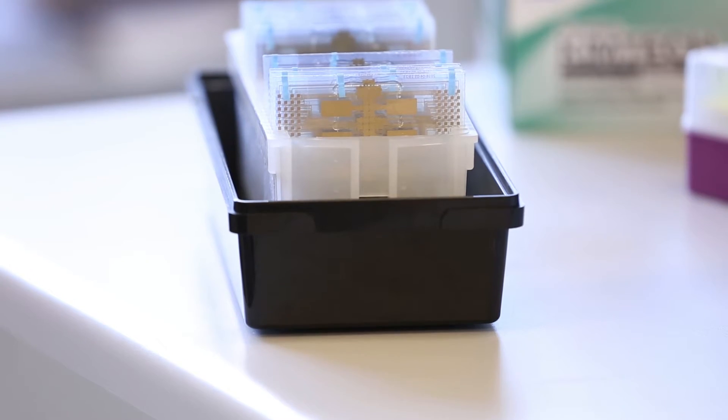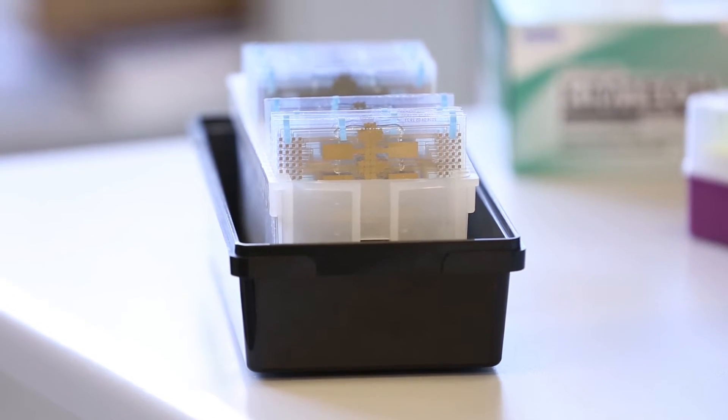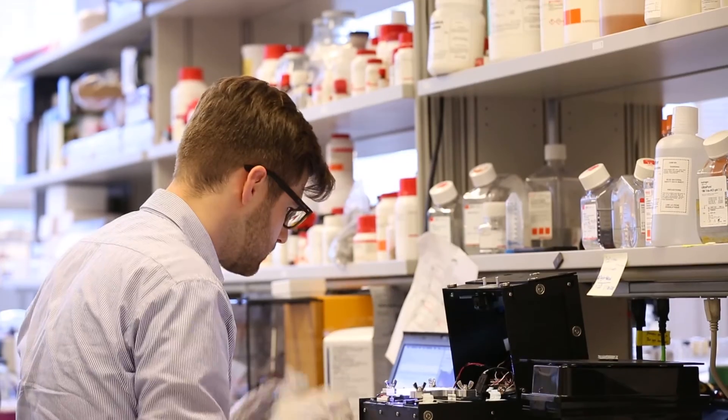Within a day we can print about 80 to 100 devices, so the next day I have to manually screen 80 to 100 devices. To help with meeting our deadline, we set a number of milestones in this project to make sure that we were able to produce the devices in the quantity that we needed and to get the assays working and running.